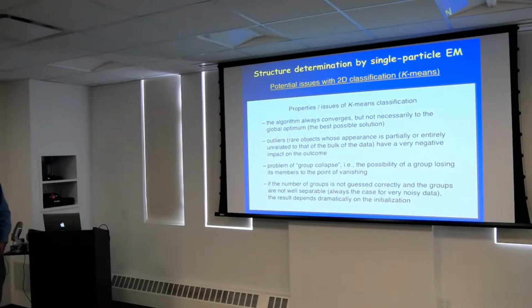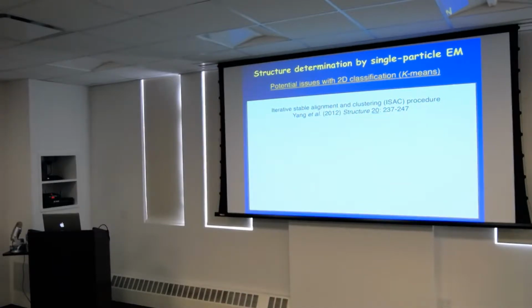This used to be different from these days, where during the whole data processing you have 3D classification and refinement. But at a time when we really didn't have 3D classification, we didn't get to very high resolution. For us, it was really important to get really nice 2D averages, which would then be combined into an initial 3D model that we would trust. So it was an issue at the beginning with these k-means classifications because the classes were not all that good.